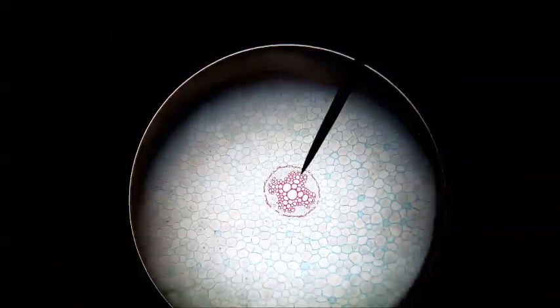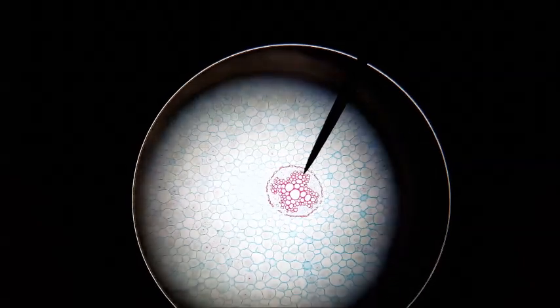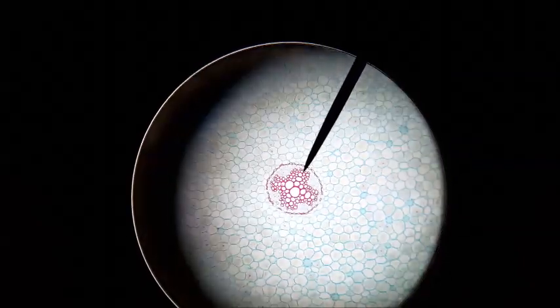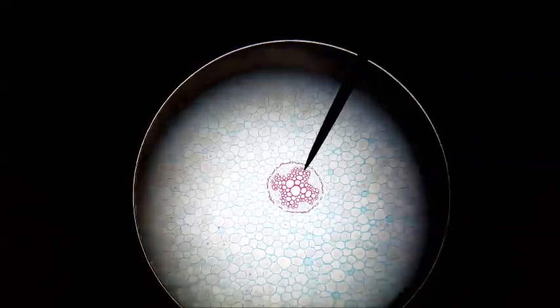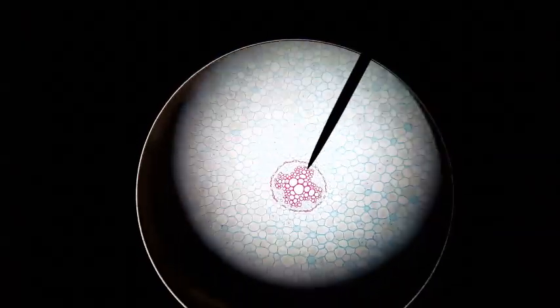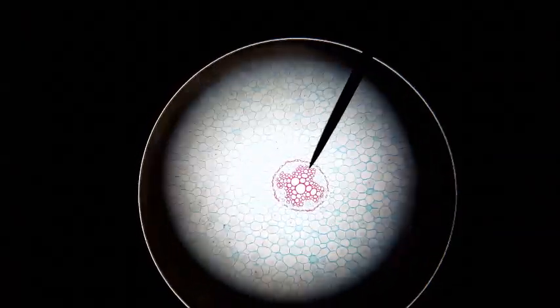The pericycle is a membrane separating the phloem between the arms from the endodermis. Cortex surrounds all.